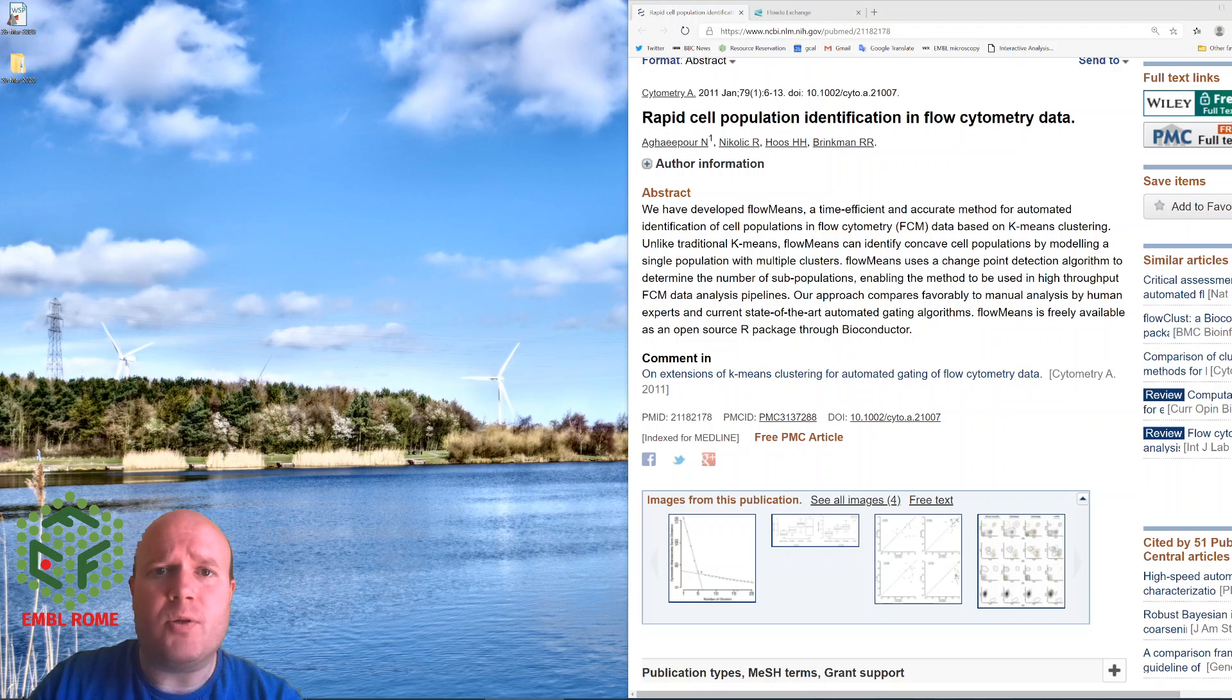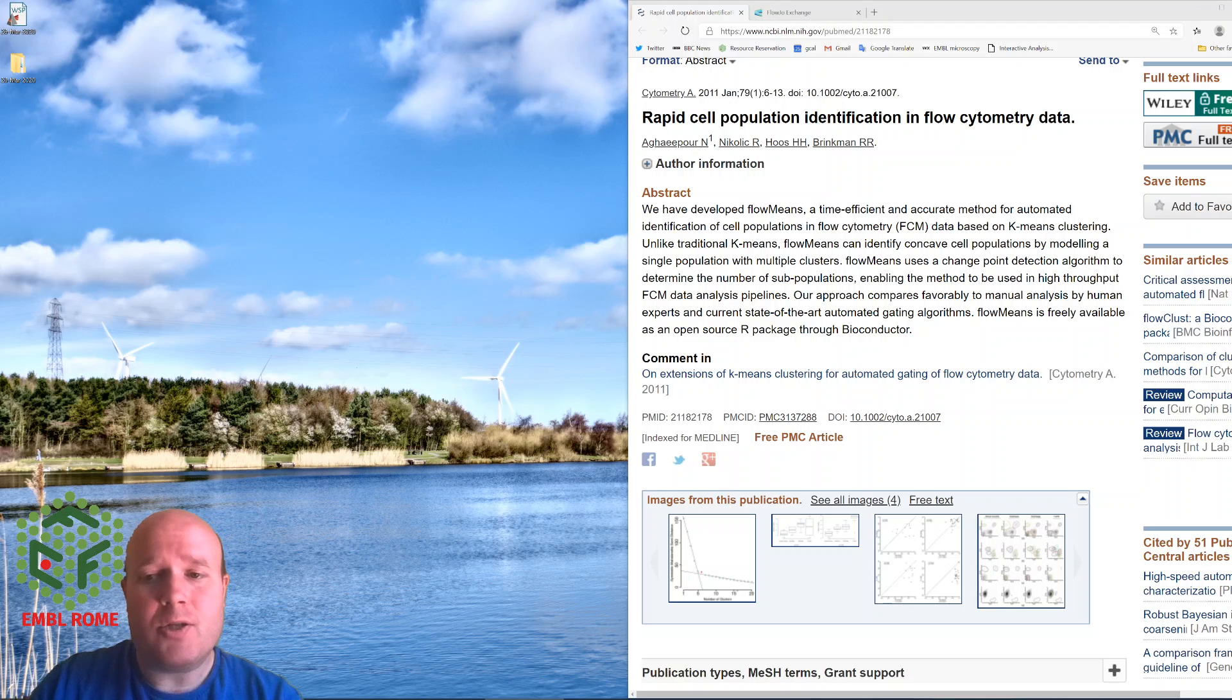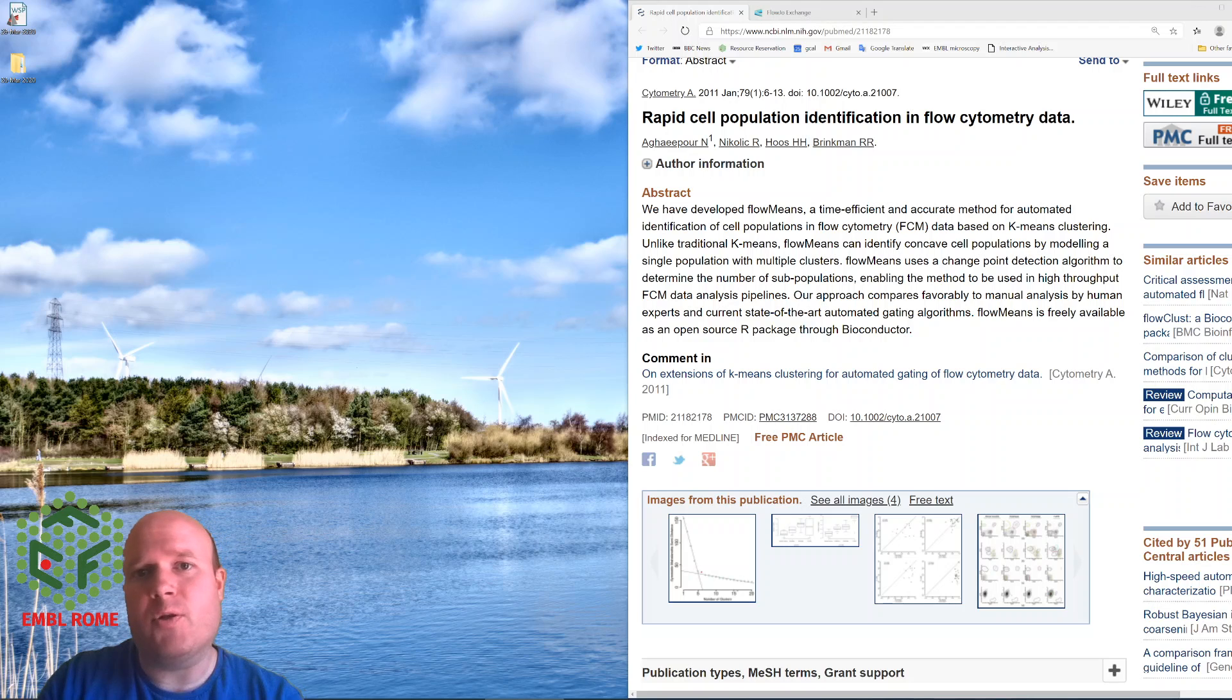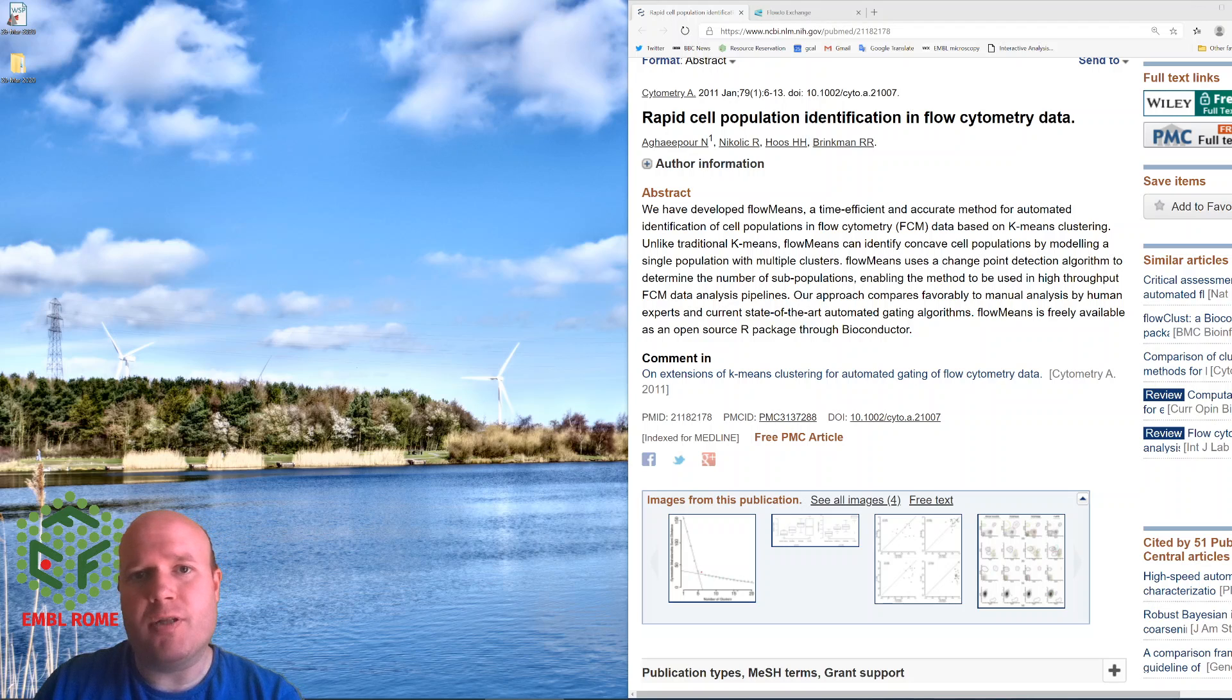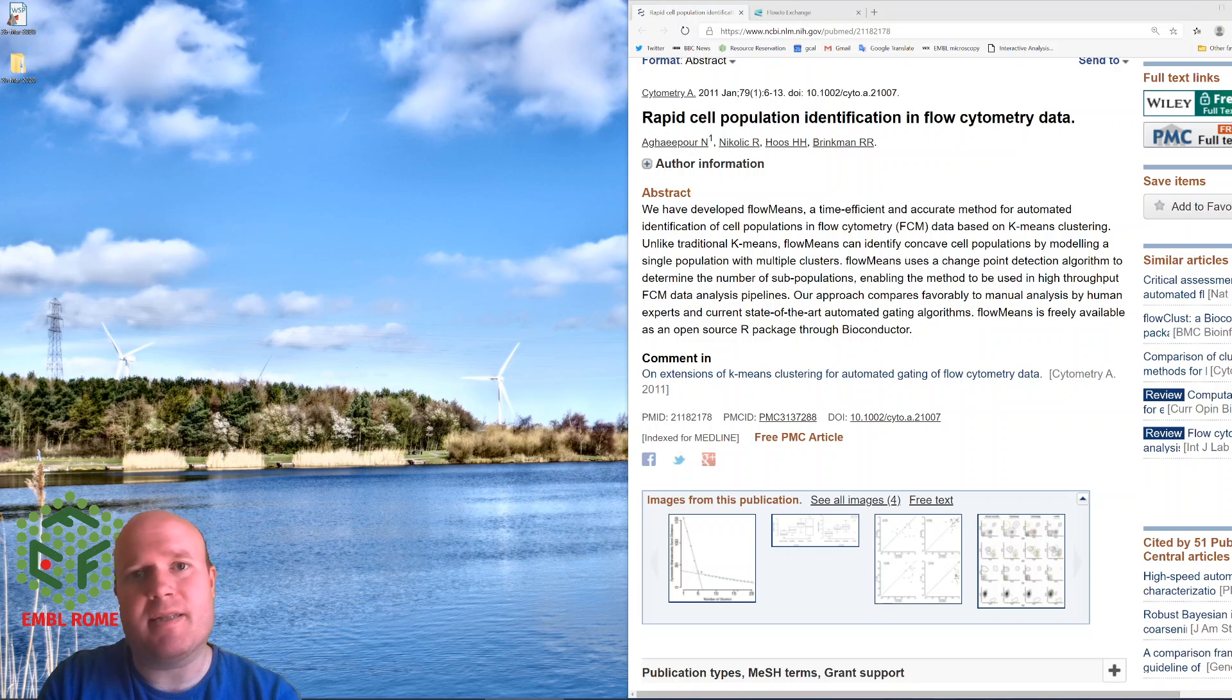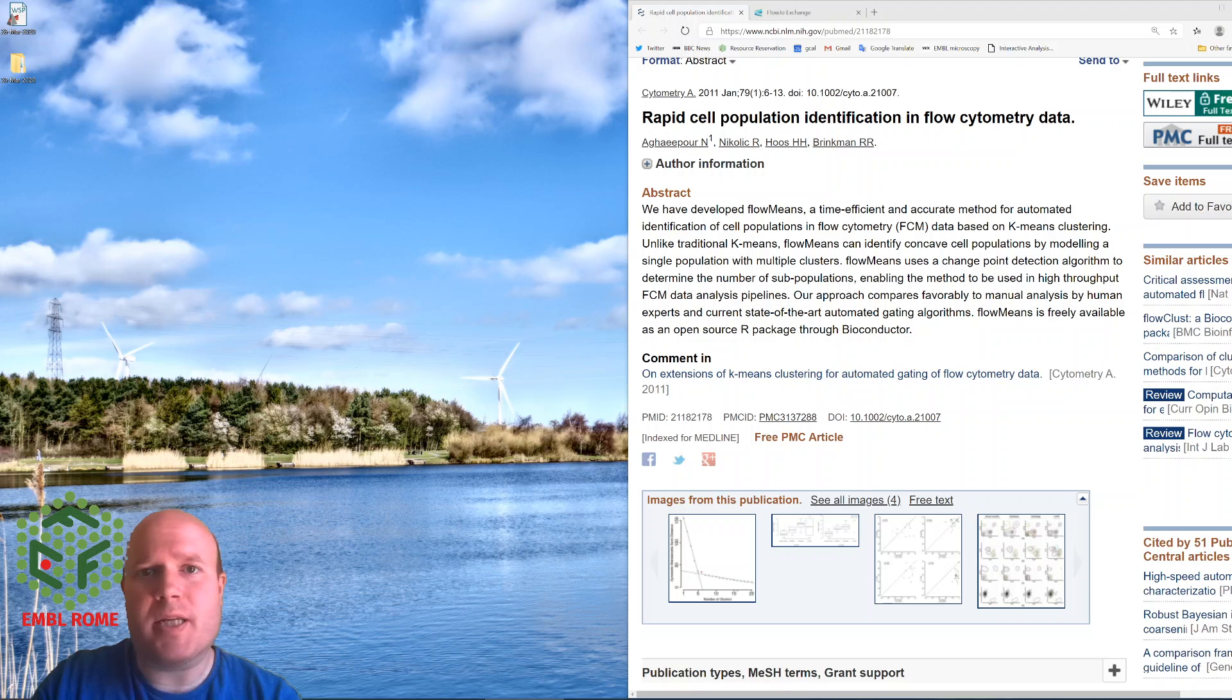So first of all you will need to install the plugin. What FlowJo does is it takes the R package FlowMeans, loads your data from FlowJo into R, runs FlowMeans and then exports the results back into FlowJo for your analysis and visualization.